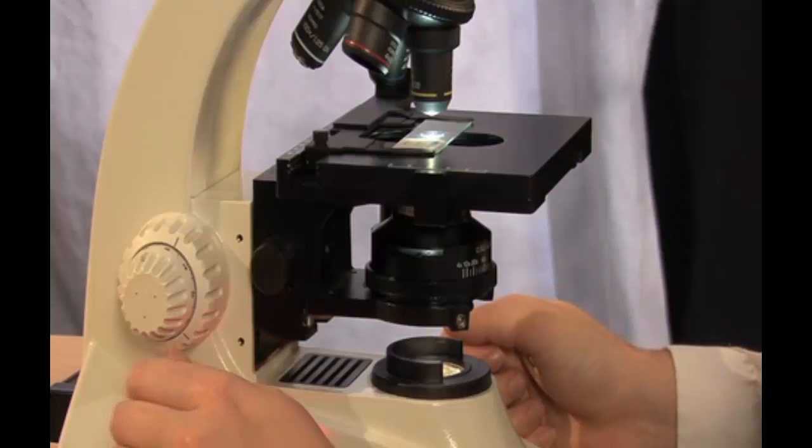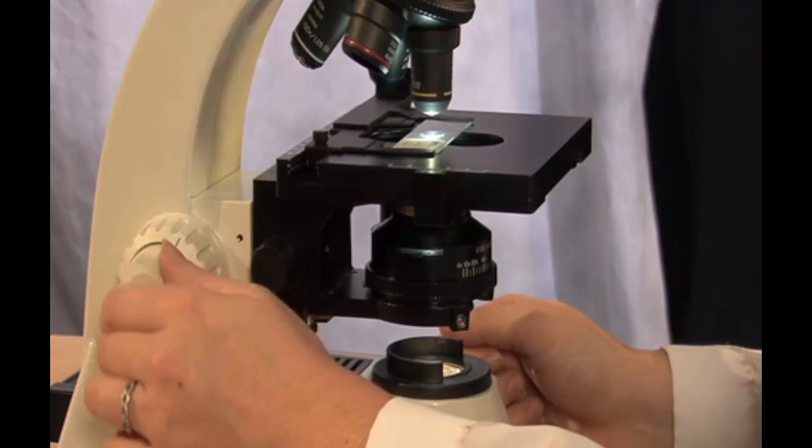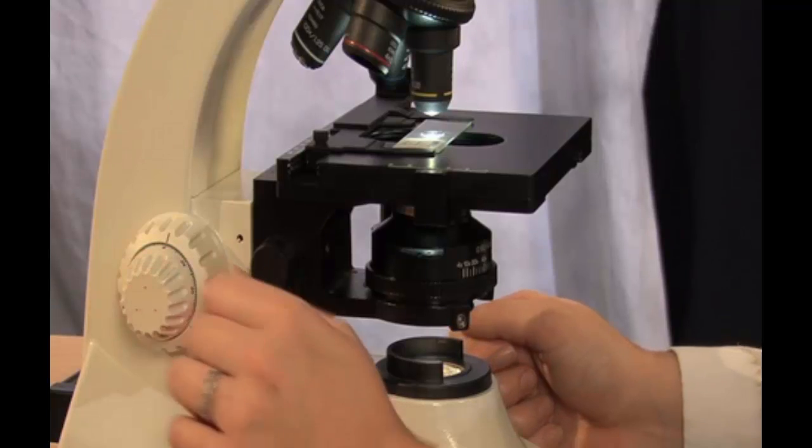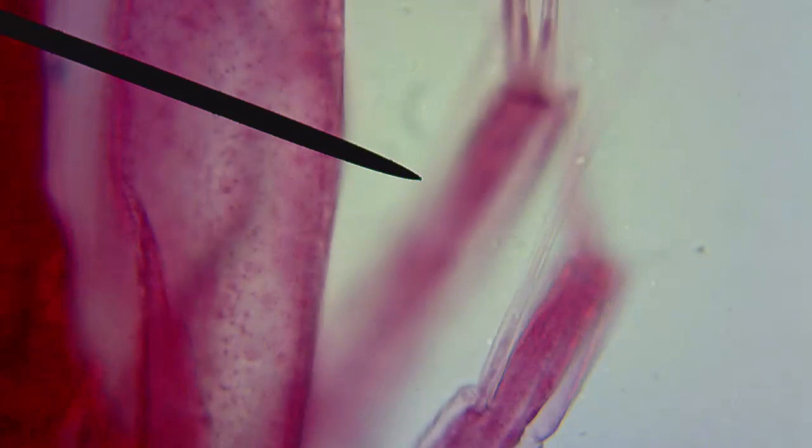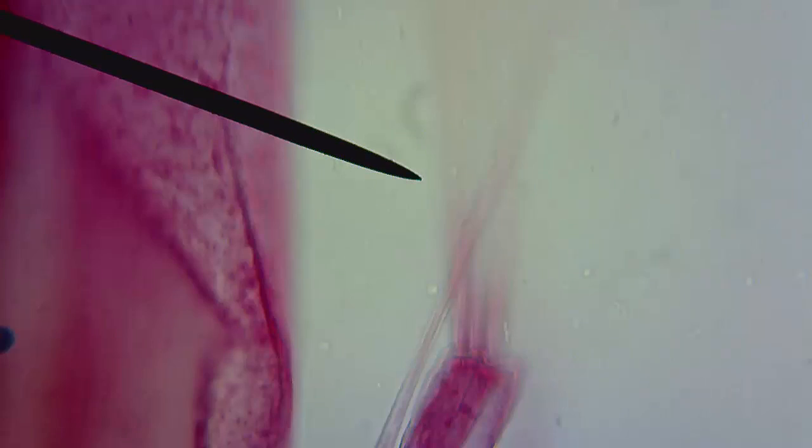In contrast, the inner knob is the fine focus knob. Notice that you do not see much movement with the stage at all when you turn this fine adjustment knob. The fine focus is used for seeing the specimen with more clarity. In other words, for seeing details.